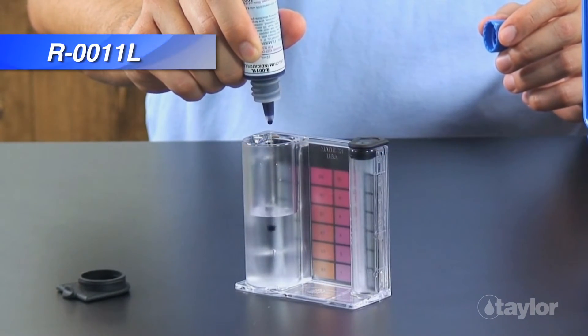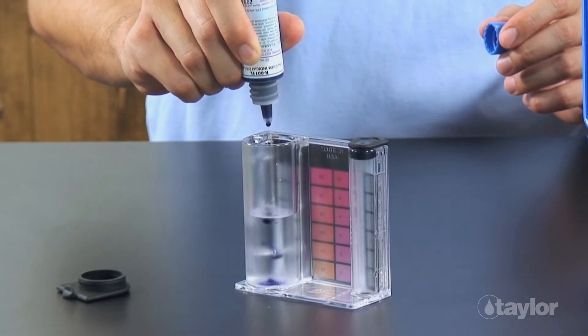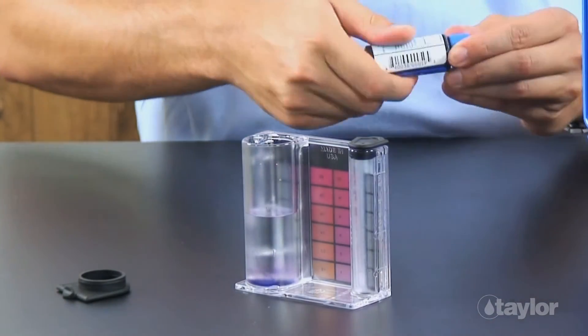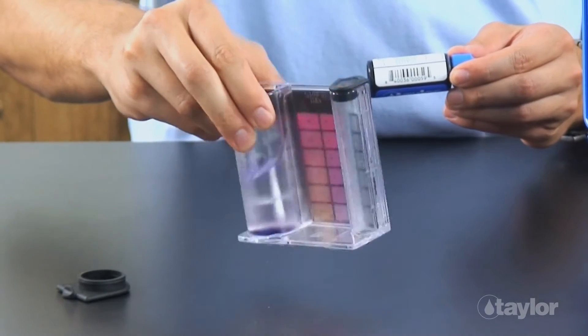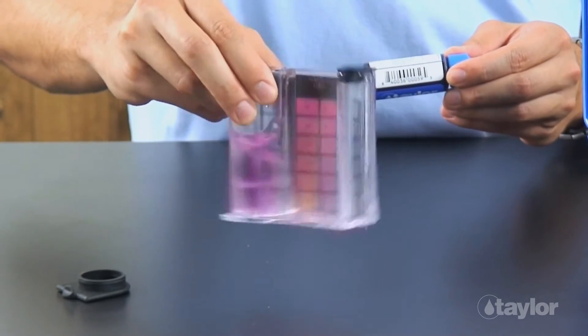Add 5 drops of reagent 11L. Swirl to mix. If calcium hardness is present, the sample will turn red.